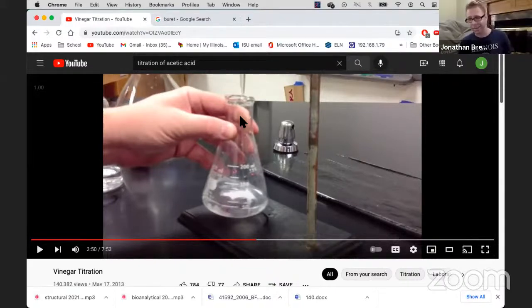And this is a really good thing just to do on the first one. If you're totally new to this and don't know what's happening, just plan on throwing out your first run and go super fast to figure out about where it is, just to get the feel of it. Don't think, all right, I'm doing this in such a way that it has to be perfectly recorded. And this is commonly done in research labs. When you want to do something, you do a practice run.